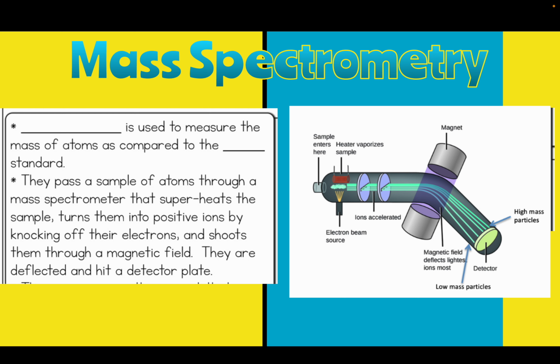So what you're looking at right now is a part of your notes. Try and follow along as I go through your notes. Also, I add in a picture here of a mass spectrometer. So you can see the sample enters here.